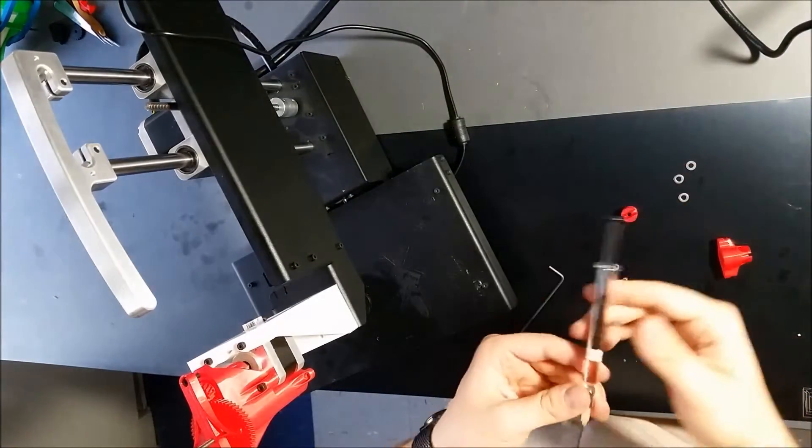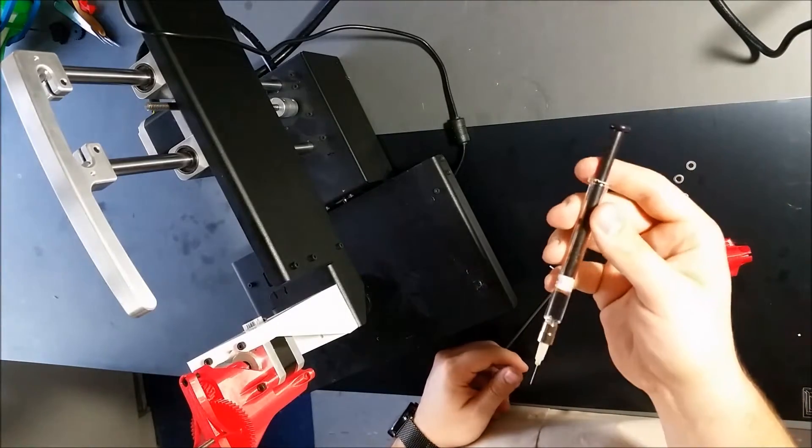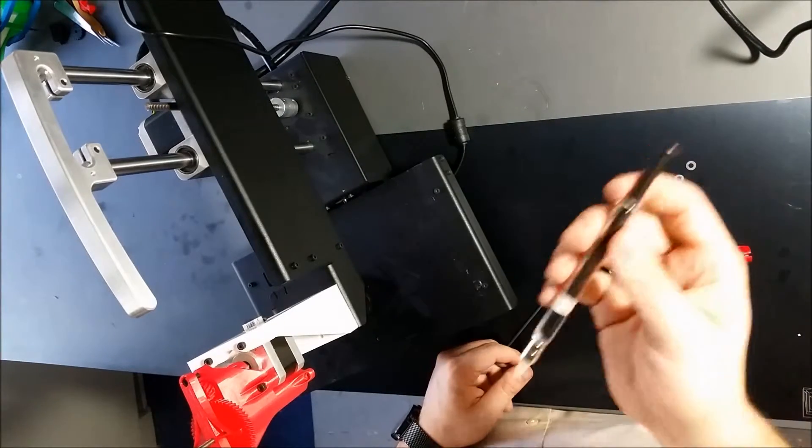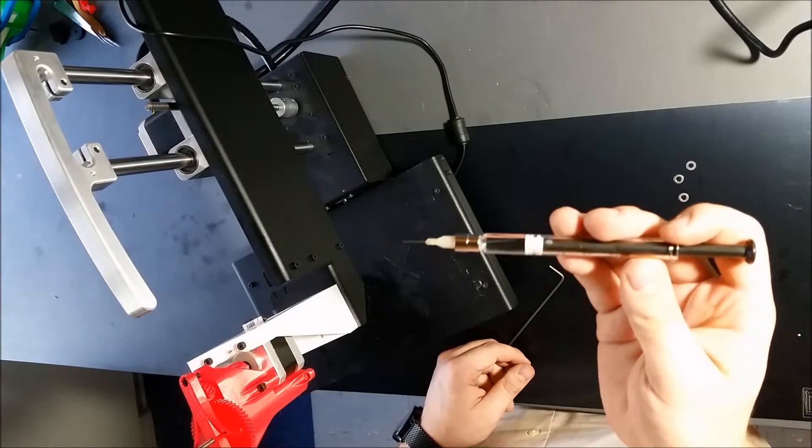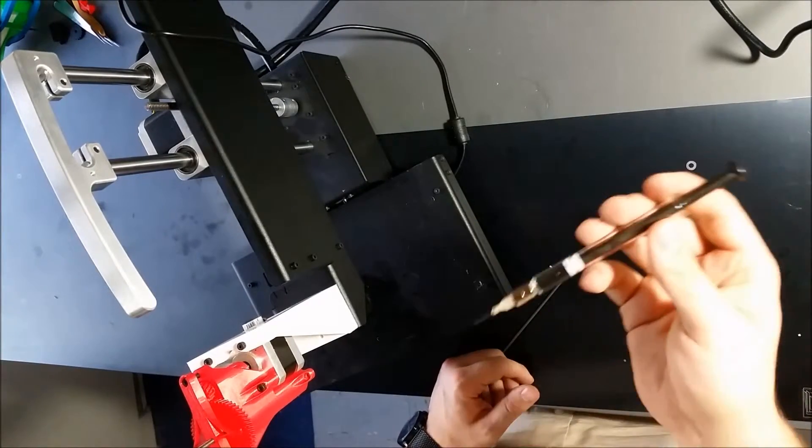So now we're going to take the 2.5ml gas tight syringe and put it in the Replostruder. We're basically going to load the Replostruder. So imagine this is about a little bit under a milliliter of collagen solution.